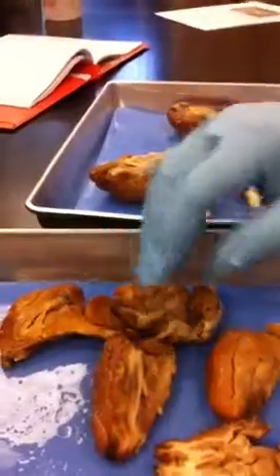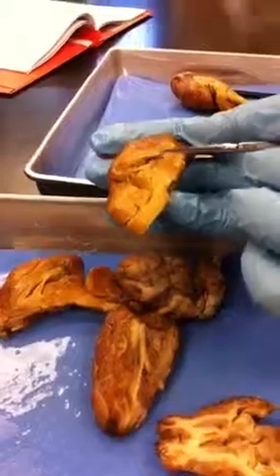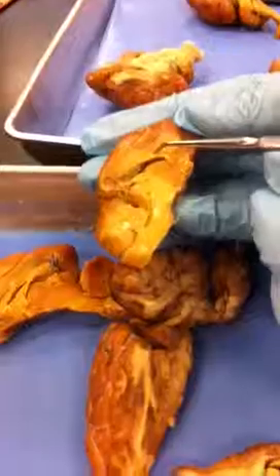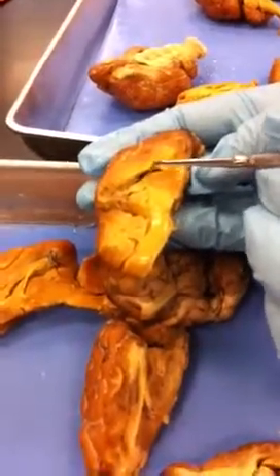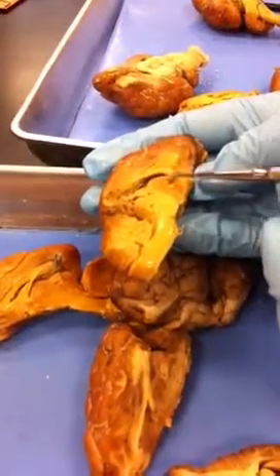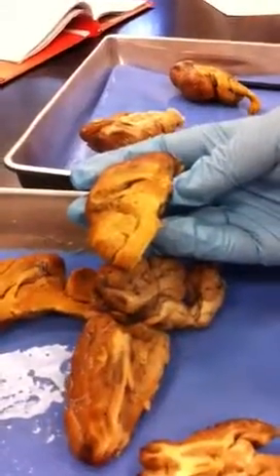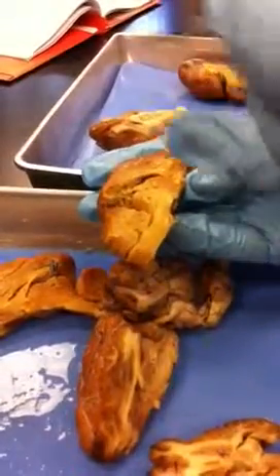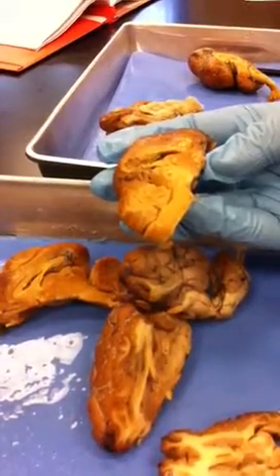Third ventricle. Okay, we kind of already alluded to that one. So the thalamus kind of rests, the diencephalon really, the whole thing, kind of rests inside the third ventricle. So when you're looking here, that spot where the septum pellucidum is, that's the lateral ventricle. And then down here, you can kind of see that space, and this is all third ventricle, right here. That's underneath the fornix, right? Yes. So the fornix, which is the floor of the lateral ventricle, kind of forms the roof of the third ventricle.